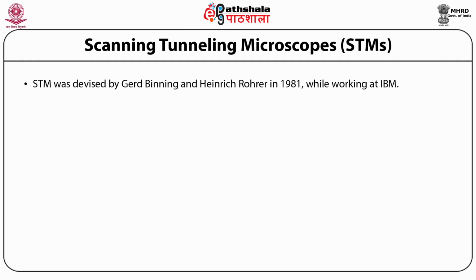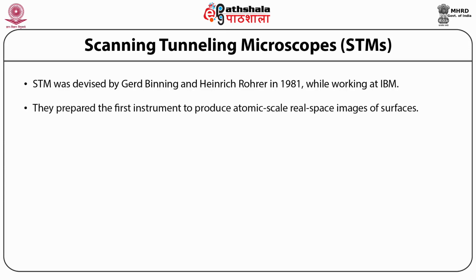STM was devised by Gerd Binnig and Heinrich Rohrer in 1981 while working at IBM. They prepared the first instrument to produce atomic scale real space images of surfaces.